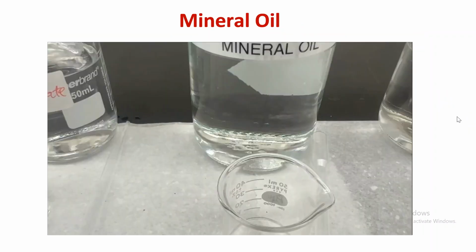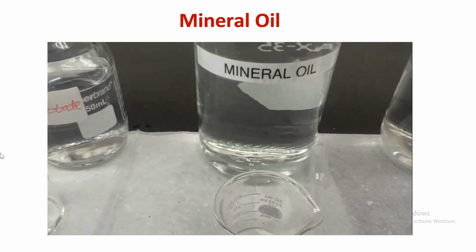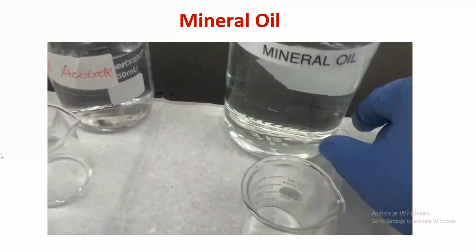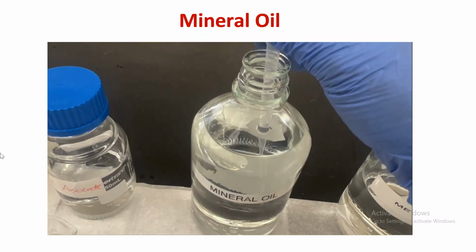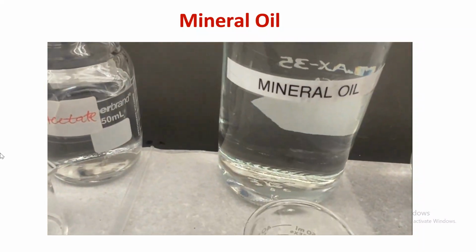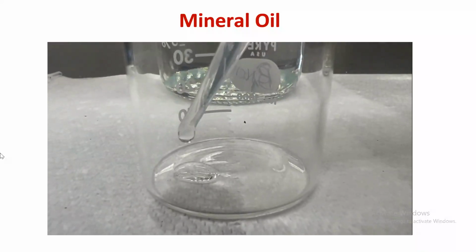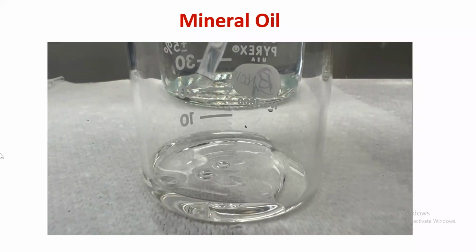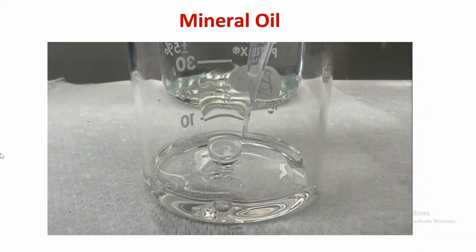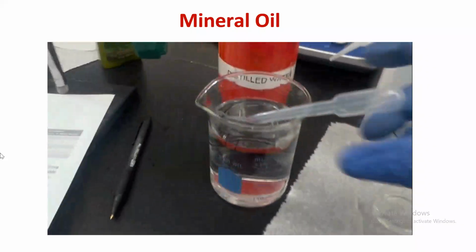The next liquid we have is mineral oil. It's a little hard to visualize again these liquids because they're all clear. So maybe this is something you might write in your conclusion. You might say it was hard to visualize because they're all clear. But notice mineral oil. Look at that. Obviously it's different from water. It's oily.